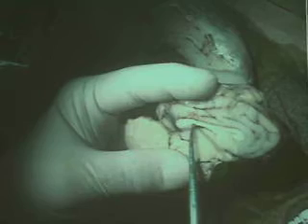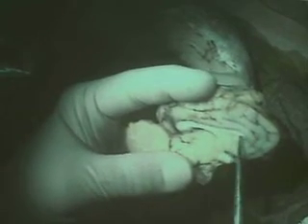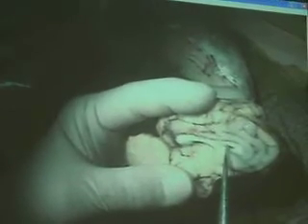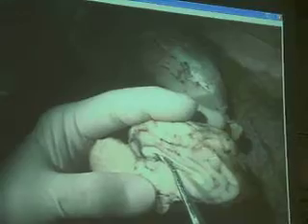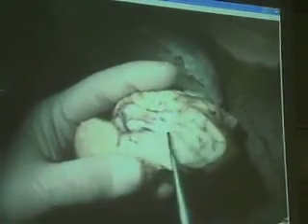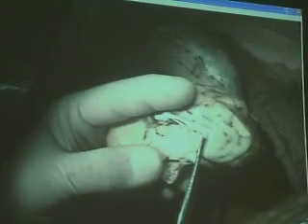There's another piece at the bottom that makes up the bottom of the lip, and that's called the fornix. So this is the corpus callosum, and this is the fornix right here. And you'll see, if you take a probe and go in here, there's a really, really thin membrane that closes off this area. The area behind it is one of the lateral ventricles of the brain. And that little clear membrane that closes it off is called the septum pellucidum.